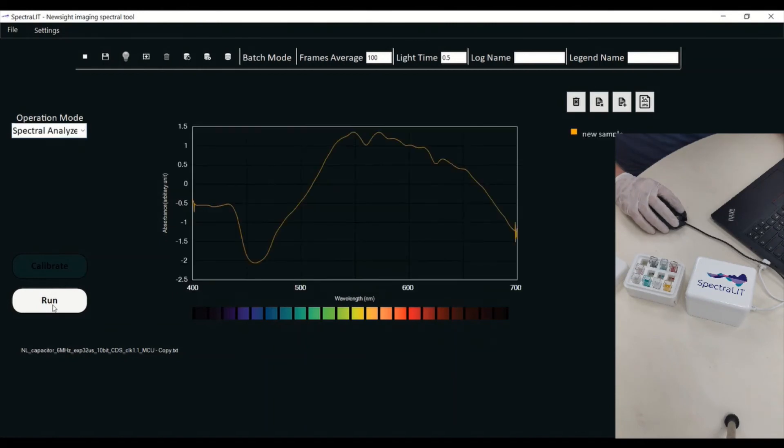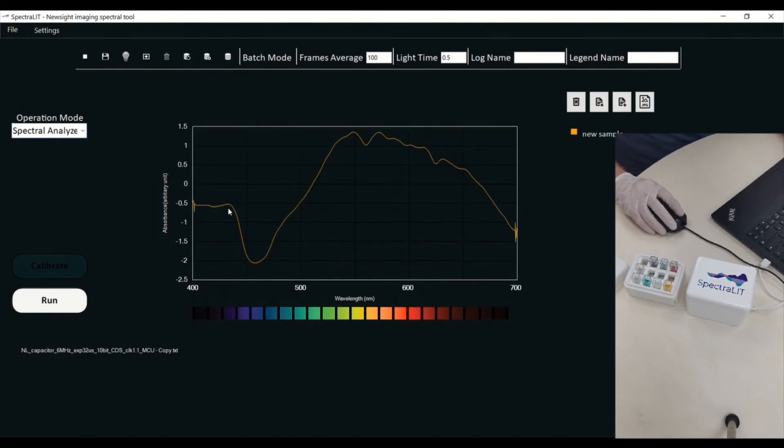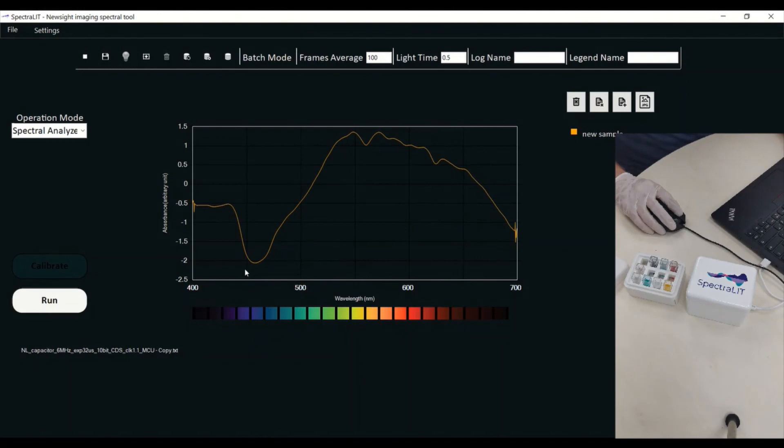I'm pressing run and what you can see is very low absorbance in the blue area, meaning that this is exactly the color that we are seeing in our human eye.